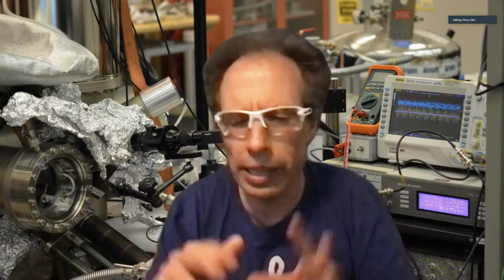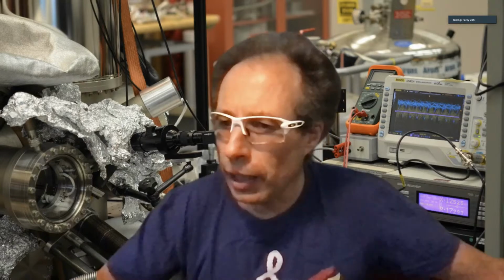There are methods called sputtering, whatever, and it's a lot of procedures to clean the surface. That is step one. Then I have something clean, like a clean tablecloth. So now I need to put something on there, like the molecule I want to look at. There are various ways to do this. One very simple way, what we're doing, is called flash deposition.